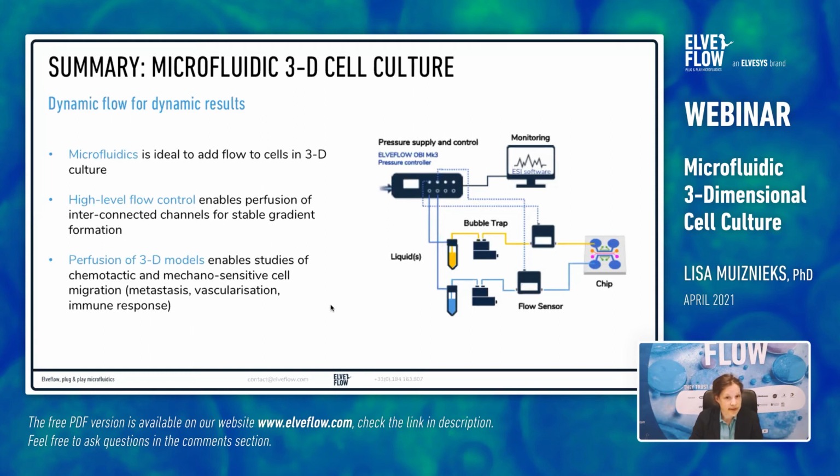Perfusion of 3D models enables the study of chemotactic and mechanosensitive cell migration for studies of metastasis, immune response, vascularization, as well as facilitating the addition of non-adherent cells and pulsatile flows.